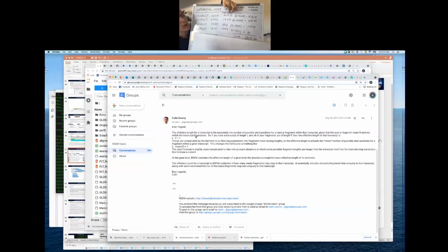So for this sample, when RSEM mapped the reads back to a particular isoform using that maximum likelihood estimation, what it found is that of the reads aligning to this gene in different regions, which of course covers all potential exons of this gene, about 70% were identified to be coming from this isoform, about 12% from this isoform, and about 17.5% from this isoform, and we got none of this last isoform expressed in the sample.